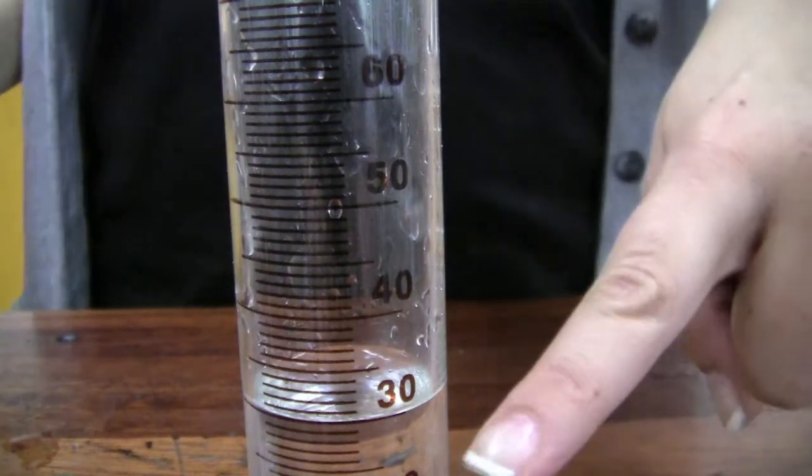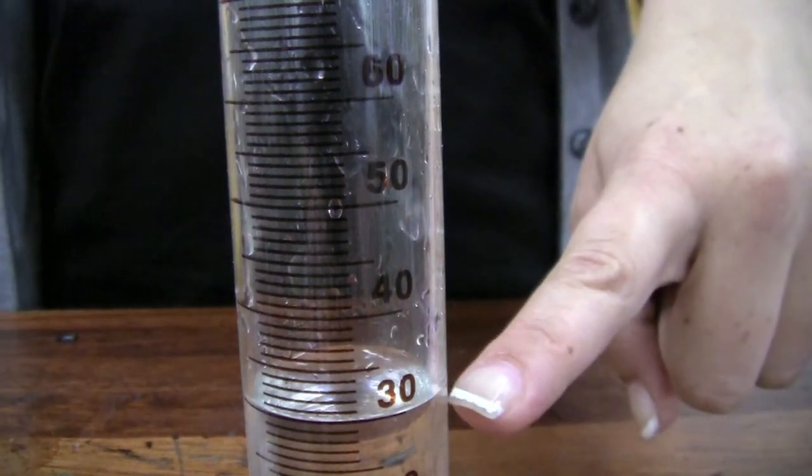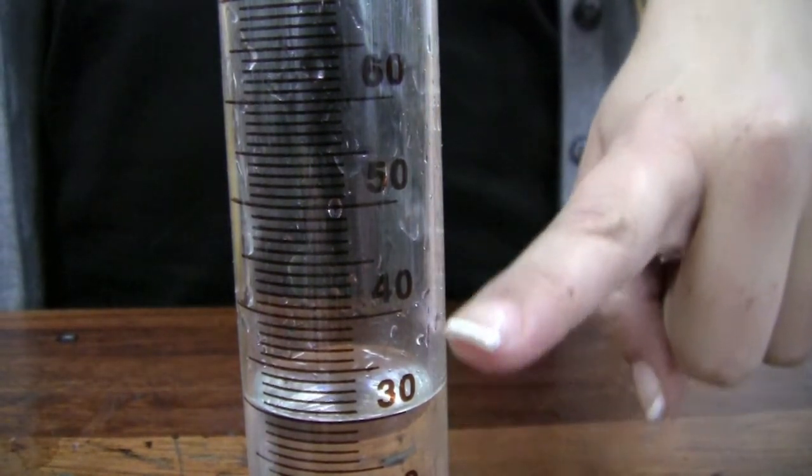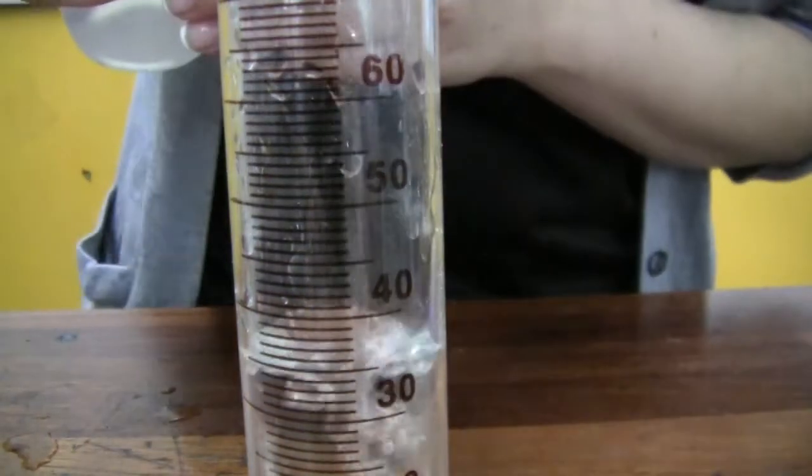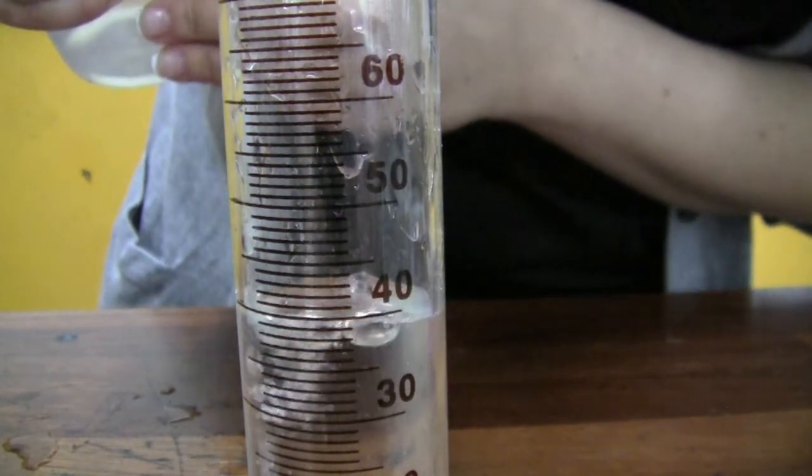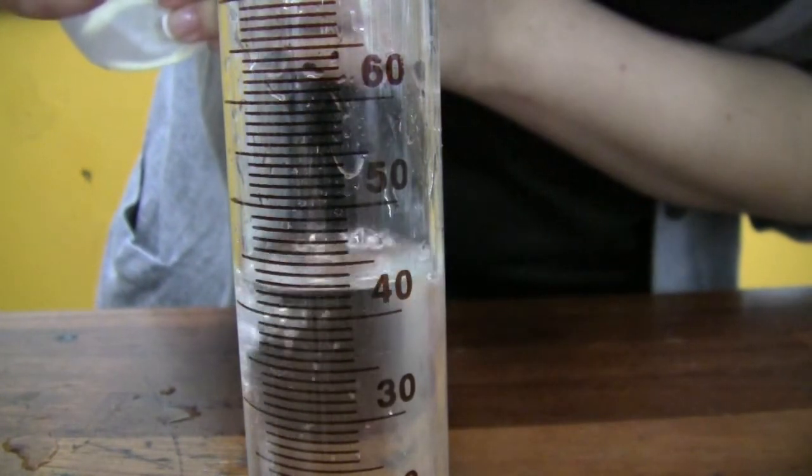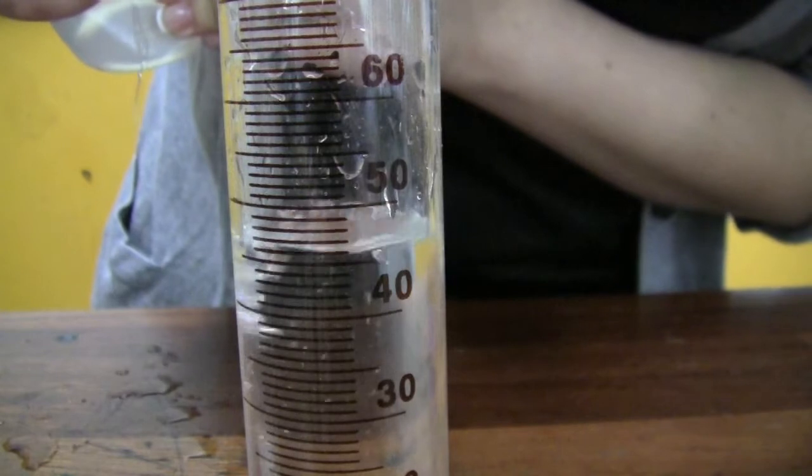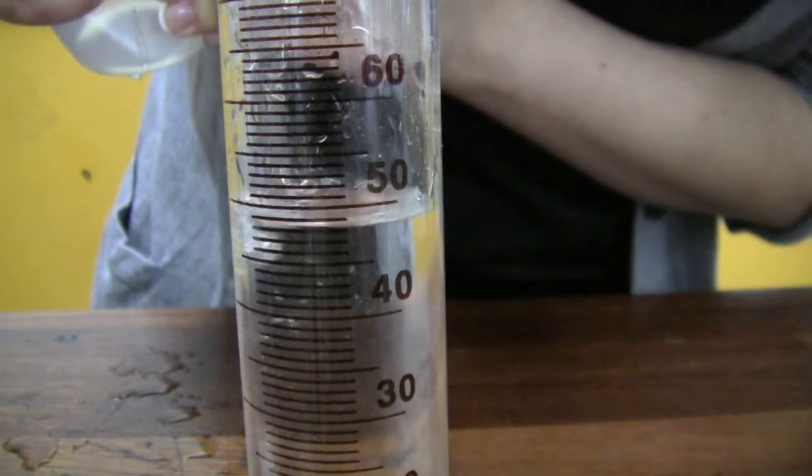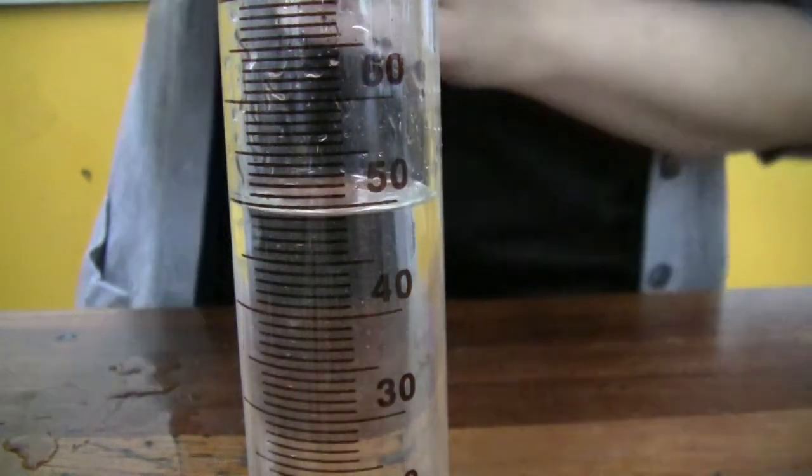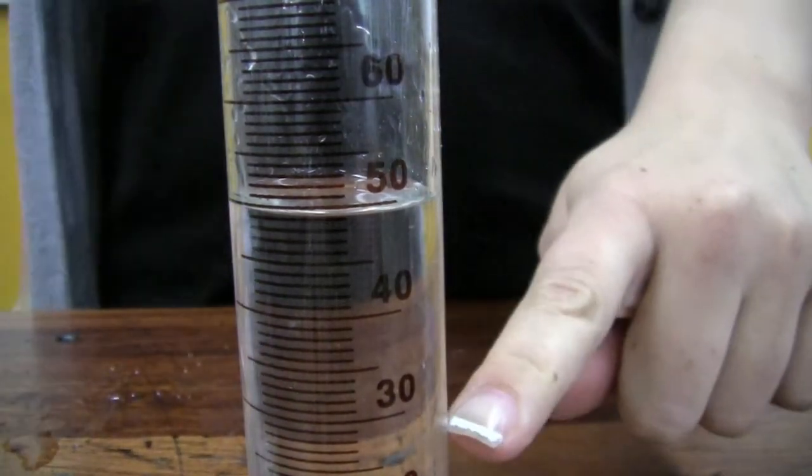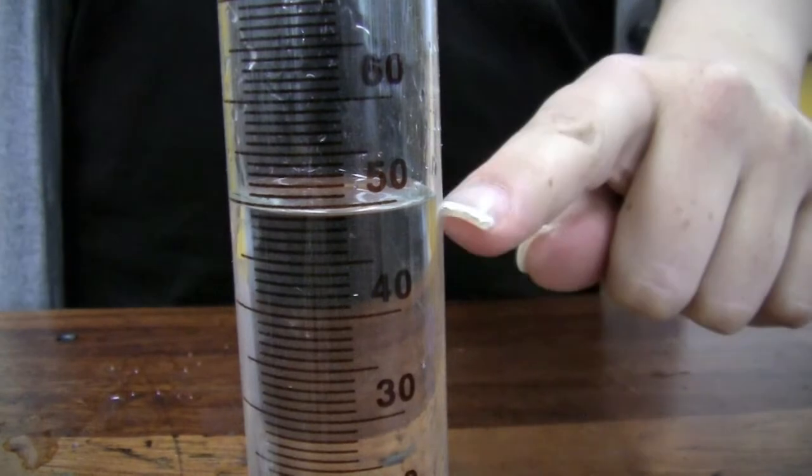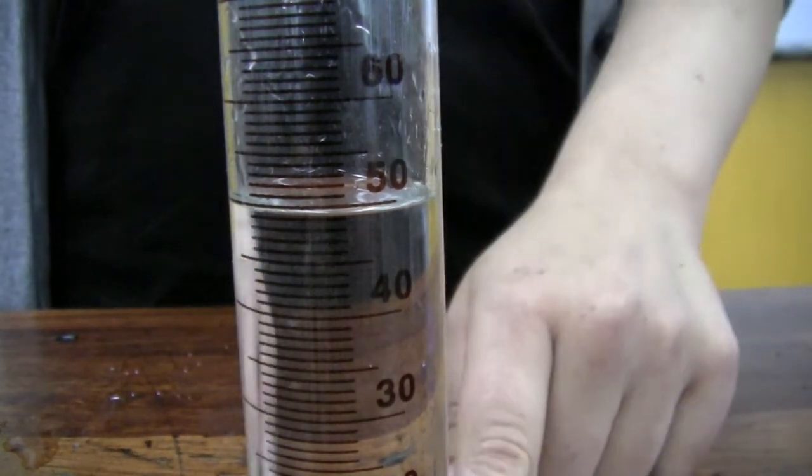Then we've got 30 ml of sodium thiosulfate. We now need 20 ml of water to make it up to 50, using the squeezy bottle again. And we stop at 50. So we've got 30 ml of sodium thiosulfate and 20 ml of water. This is our third dilution.